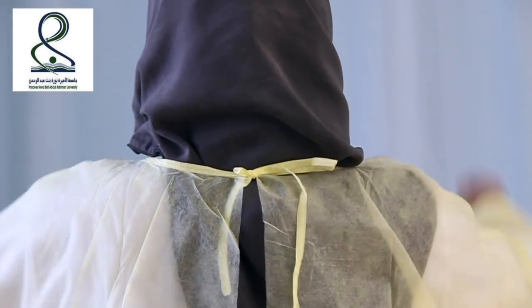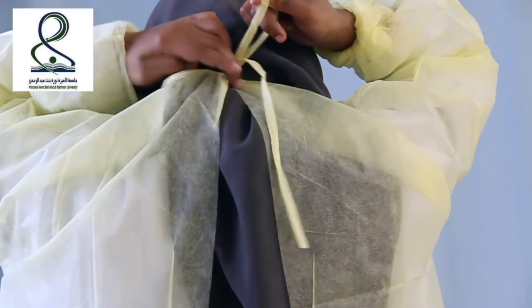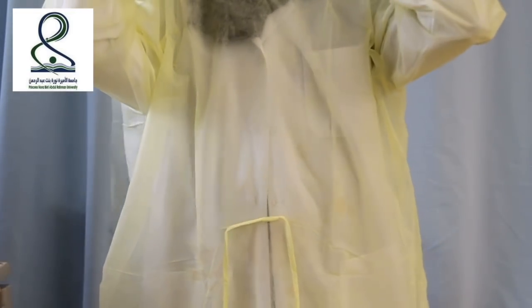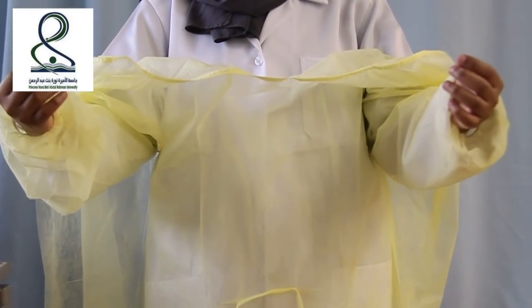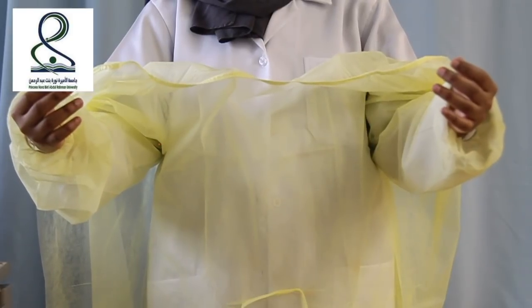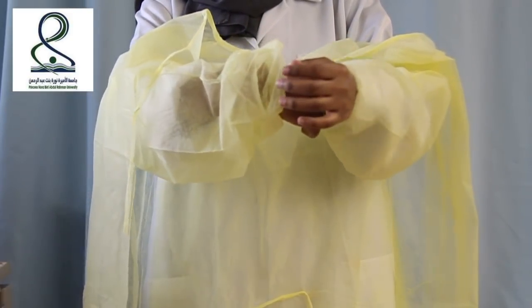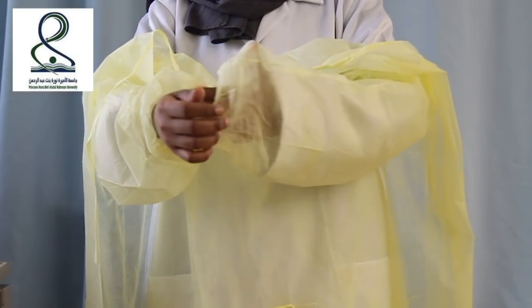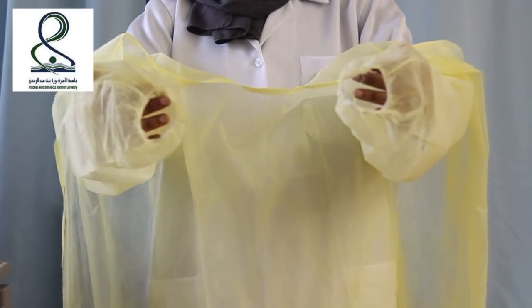Then untie the neck part and bring the gown around your shoulders so it is partly off. Then using your dominant hand, grasp the clean parts of the wrist, then roll the sleeves. Do the same for your second hand, then remove the gown.